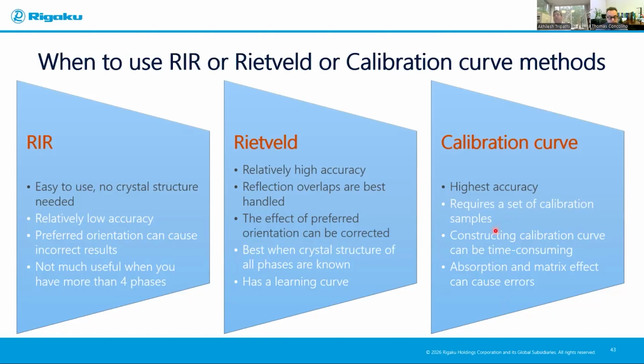You generally don't have minerals in pure form to create a calibration curve of one of the minerals. Let's talk about kaolinite. You don't have a pure kaolinite, so you can't get kaolinite numbers because you can't create a calibration curve for kaolinite or any smectite or illite, for example, or in cement C4AF or C3S.